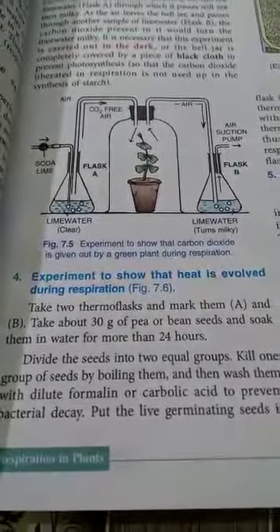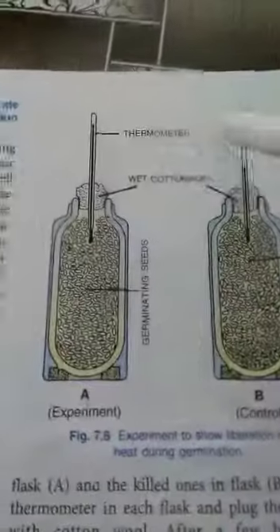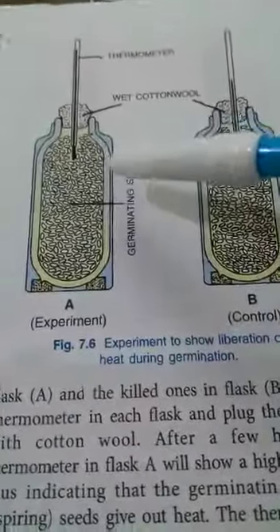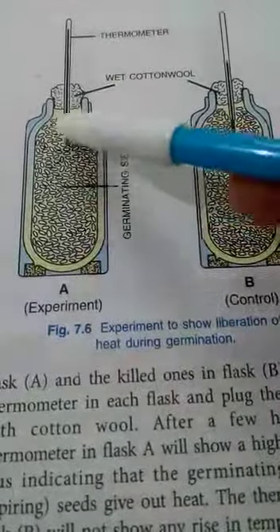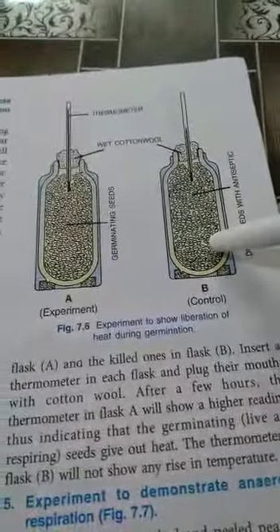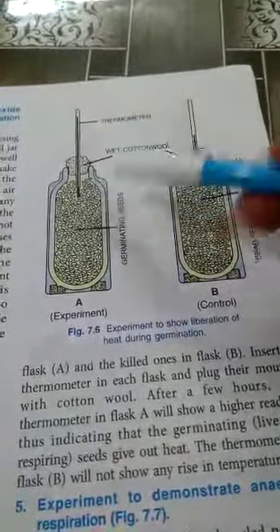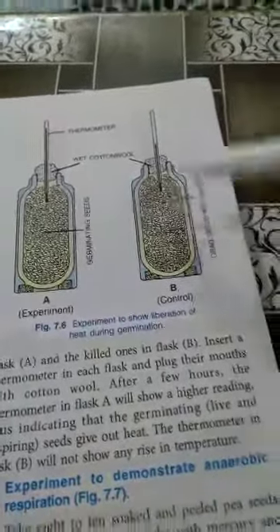The next experiment is to show that heat is evolved during respiration. For this experiment, you have to take two glass thermoflasks. In these thermoflasks, we will put seeds. In flask A, we will put germinating seeds. In flask B, we will put dead seeds. We will place cotton wool here and place a thermometer in both thermoflasks.